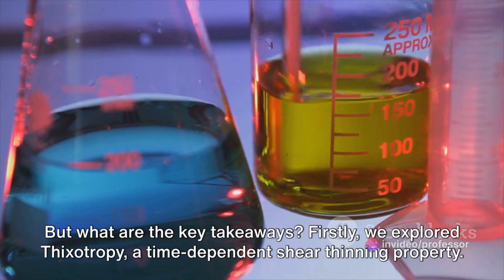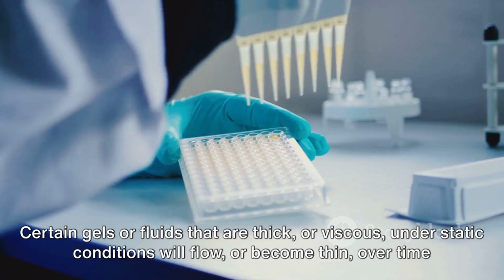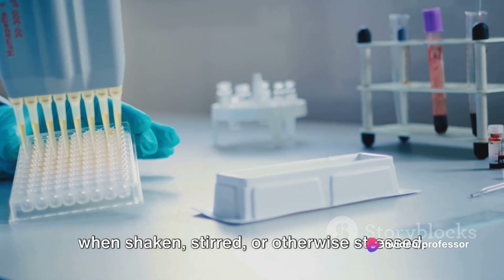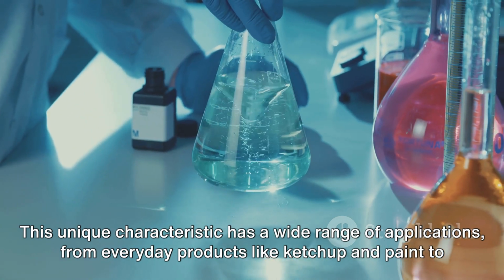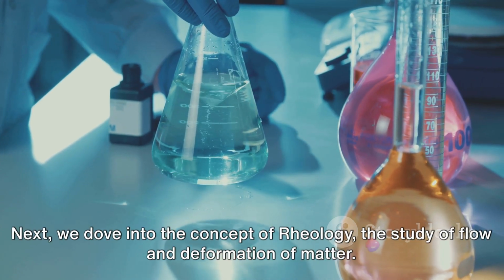Firstly, we explored thixotropy, a time-dependent shear thinning property. Certain gels or fluids that are thick or viscous under static conditions will flow or become thin over time when shaken, stirred, or otherwise stressed. This unique characteristic has a wide range of applications, from everyday products like ketchup and paint to complex pharmaceutical formulations.